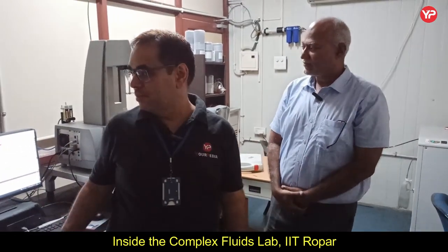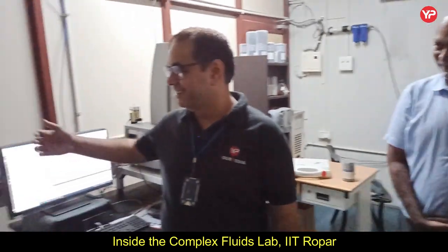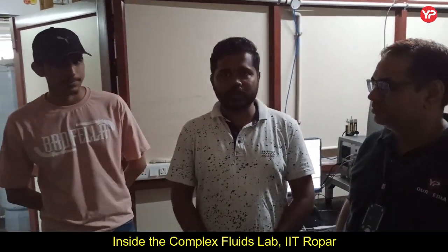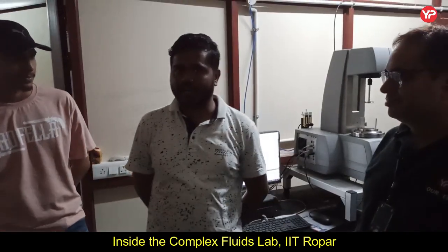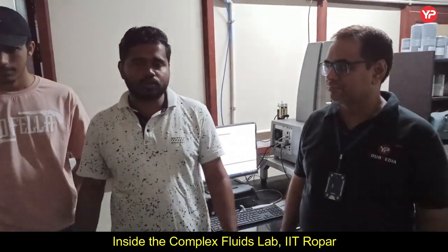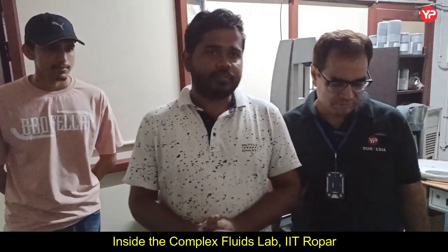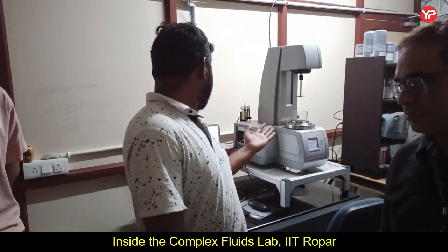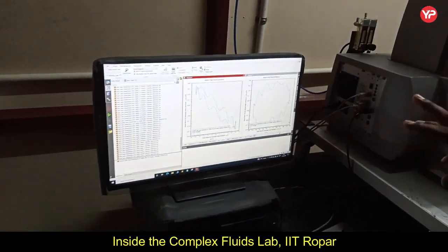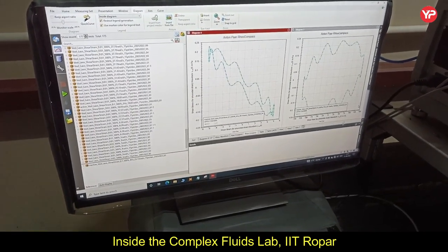So right now we have some people here. You are students here? You both come, just tell us about yourselves. I am a PhD student. I am working on active suspensions. We are trying to understand the behavior of that active suspension, and for this we are using this rheometer, and these are some patterns we are recording on this rheometer.